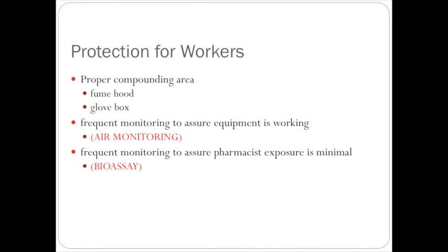The other thing is we're going to actually test the user. In our case, it's a pharmacist. We can do it sometimes with different members of the staff. Some people do it with their drivers. It really just kind of depends. But since any radioactive iodine exposure that you're going to get is going to end up in your thyroid gland, we're going to test your thyroid gland by way of bioassay to try to figure out if you were taking any iodine in.